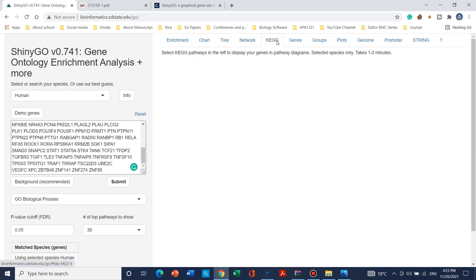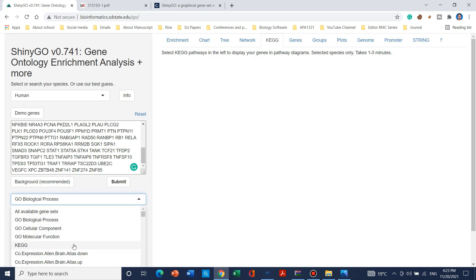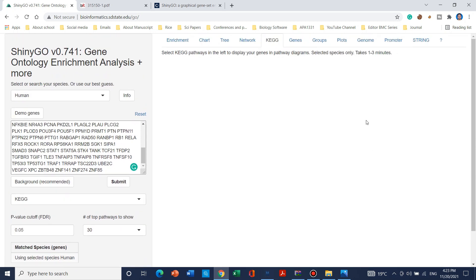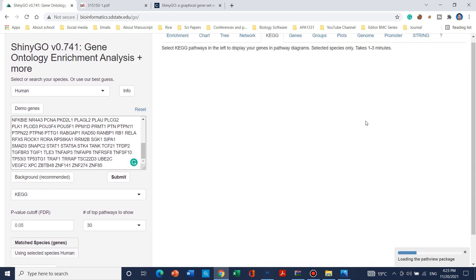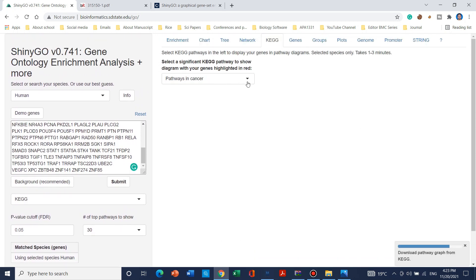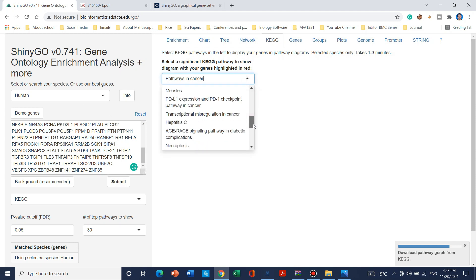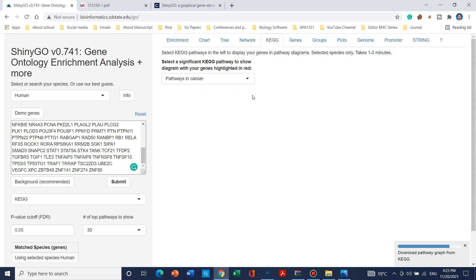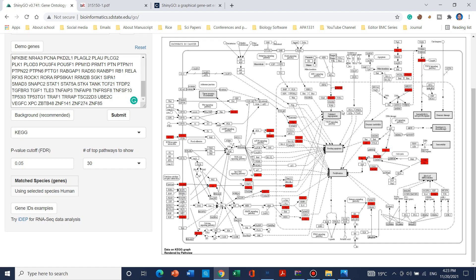Moving to KEGG pathway — when you select KEGG pathway, make sure that KEGG is selected from the dropdown. It will take a few seconds to create the KEGG pathway. From the dataset you can select which pathway you want to draw. Let's say we select the first one and download it. The pathway is automatically generated and can be saved similarly.